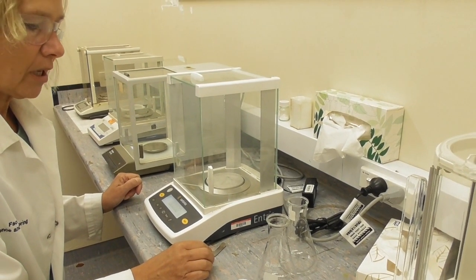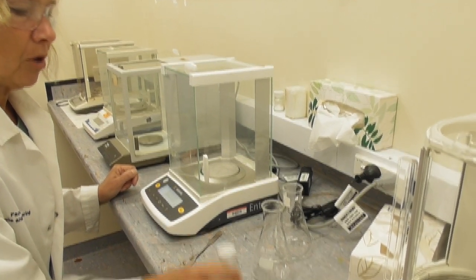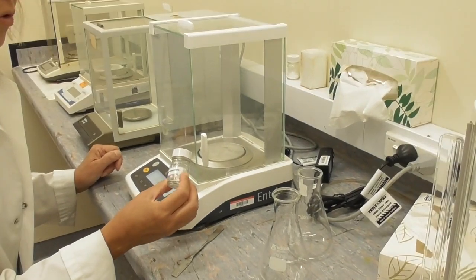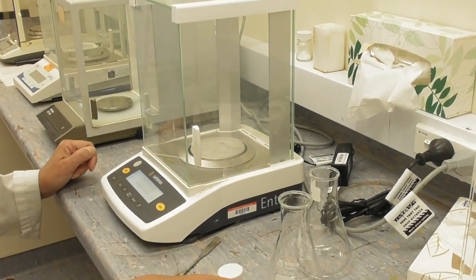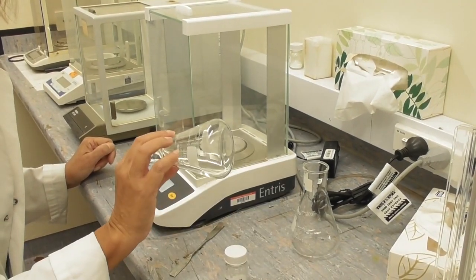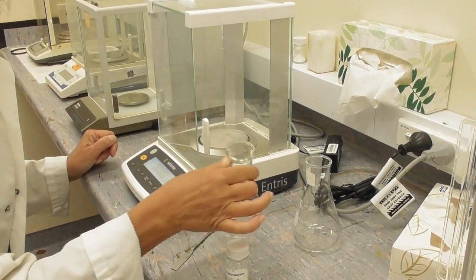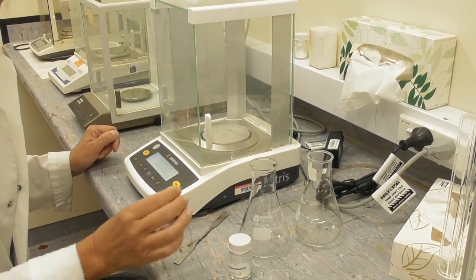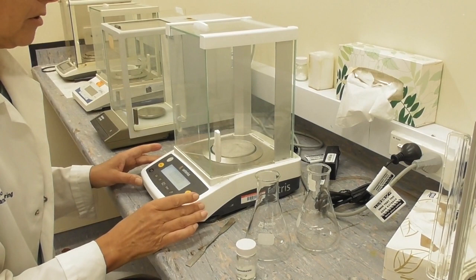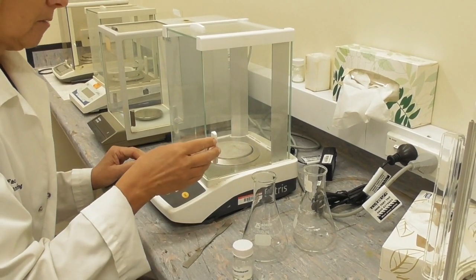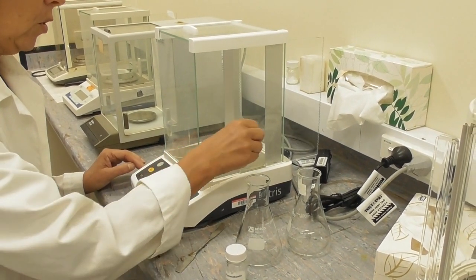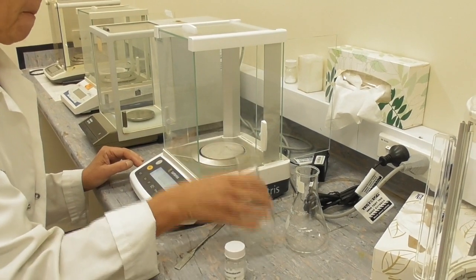To start my titration I have to weigh out about 0.2 grams of sodium peroxyborate into a dry conical flask. The weight needs to be determined on an analytical balance which shows weight into milligram range.